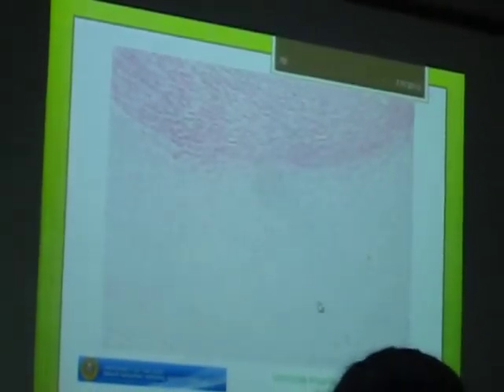Classify the pointed tissue. This is high power. So let's start again. Mesenchymal tissue. So when you say mesenchymal, what's the other embryonic type of tissue? The other one. Mucoid. Mucoid or mucous connective tissue.